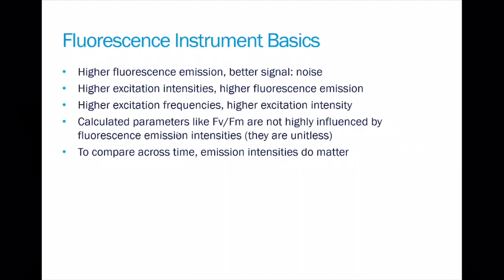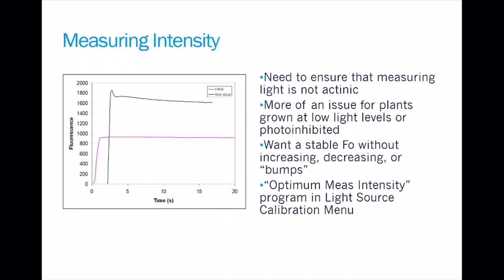It's important to remember that most of the fluorescence parameters we're interested in are ratios. They are unitless. If you want to combine parameters that are collected at different times, it is important to make sure you set up the fluorometer the same way. We can talk about that in just a little bit.